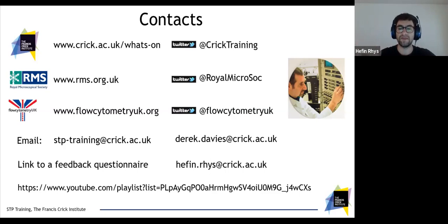In terms of the width of the image, at the highest magnification, I think the widest object you can image is 40 micron wide, and at the lowest magnification, I think you're on to something like 150 micron wide. So it's got a big flow cell. I've not ever seen anybody struggle to image large cells. If you're trying to image something larger than a cell, maybe an embryo, you might need to consider that. But if you're looking at neurons, that's fine.